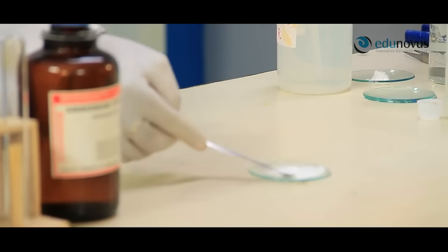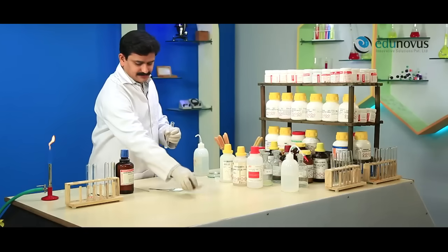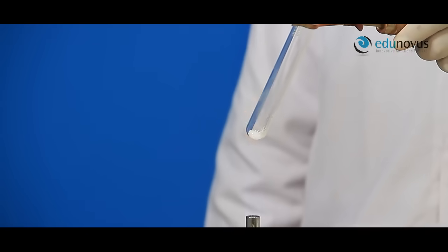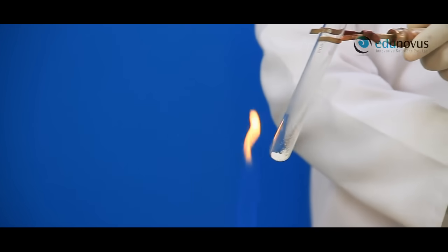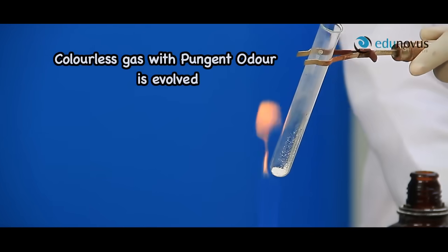Take a small amount of given salt in a clean and dry test tube and heat it using Bunsen flame. Here you can see the liberation of colorless gas with pungent odor.